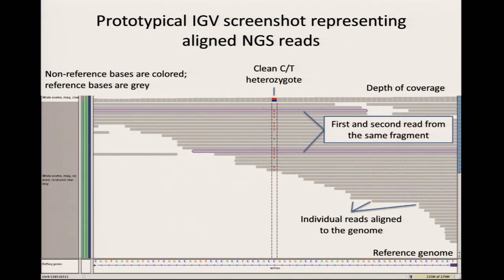And the other thing is that you probably can't see it at all, but there are really grayed out bases there. Like this is a C. It doesn't match the reference. So it's a C, but it's very light. And what it's trying to indicate there is that the machine read a C, but it wasn't very confident in itself. So maybe it's a C, maybe it's not, who knows. But it's trying to let you know that it didn't know whether it was a C or not. So it does a lot of beautiful stuff.